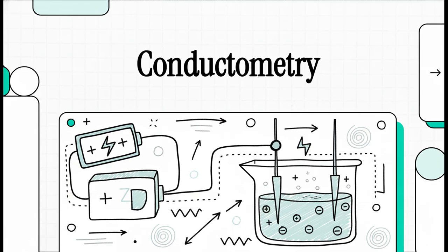Hey everyone, today we're diving into a really brilliant analytical technique called conductometry. It's an incredibly clever way of using simple electricity to see what's dissolved in a liquid, even when it's totally invisible to the naked eye. So let's get right into it.